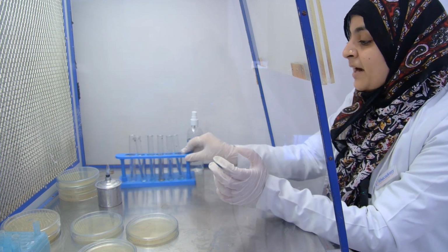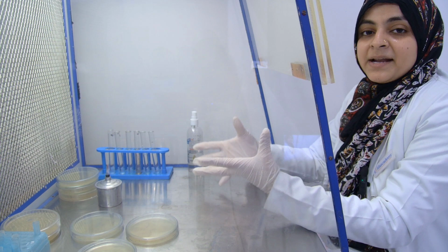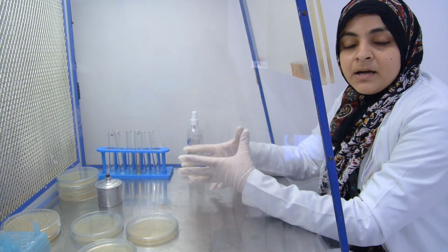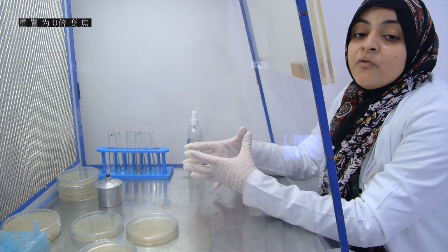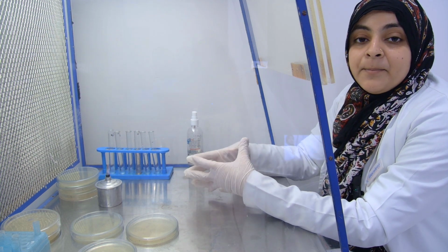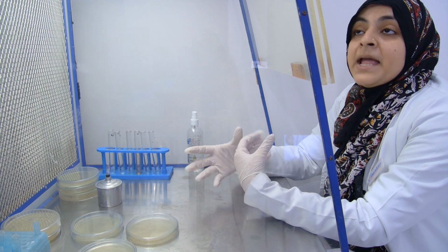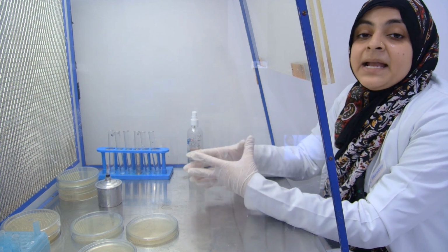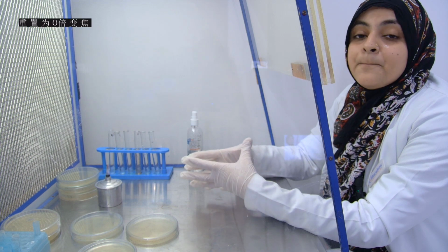Now, the experiment that we are going to perform today is the effect of the temperature. We all know that bacteria require an optimum temperature for their growth. If there is a slight change in their environment, it directly affects the microbes.